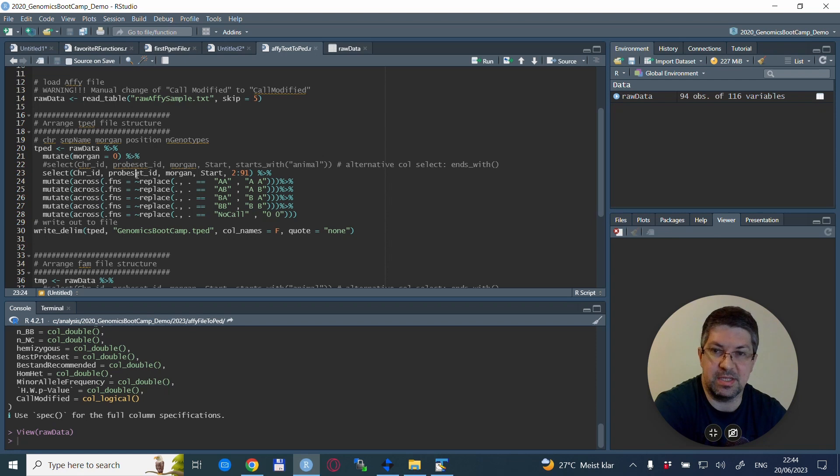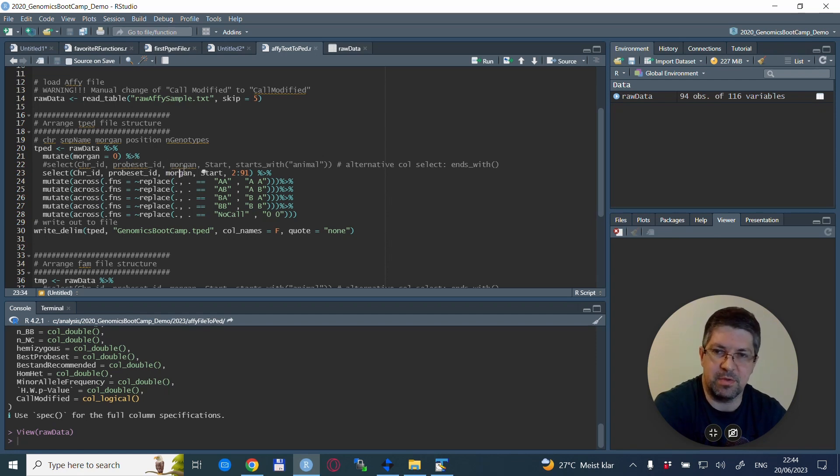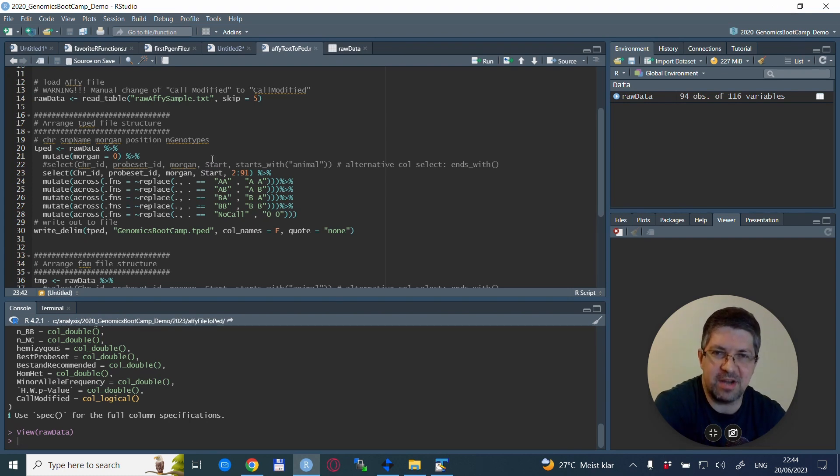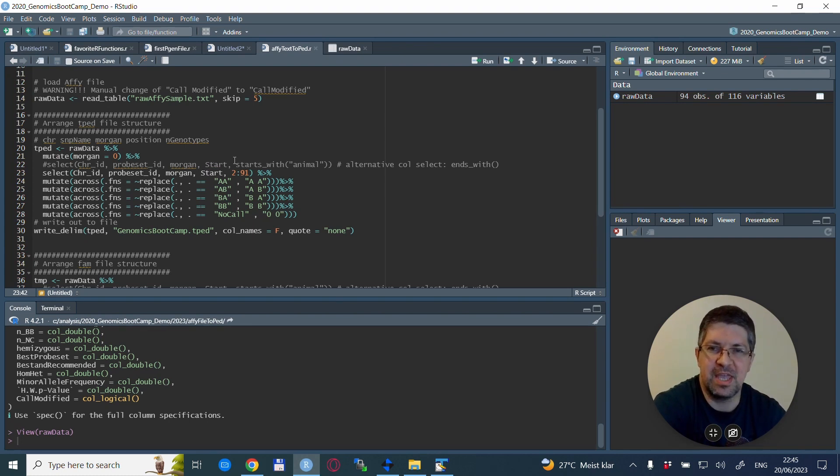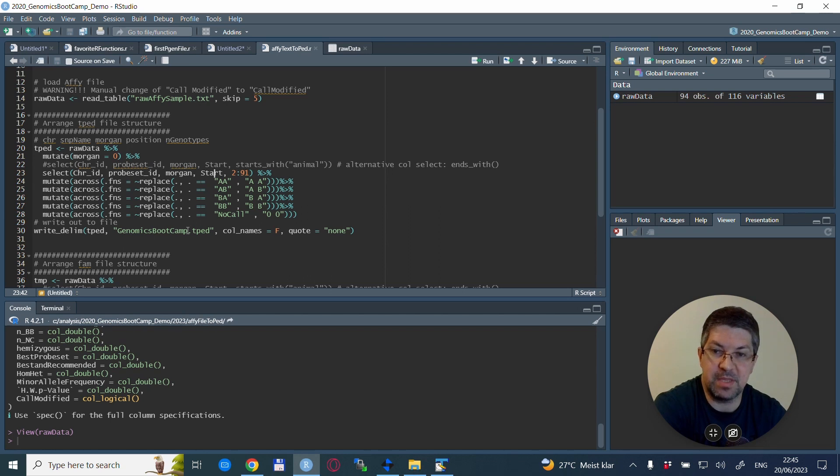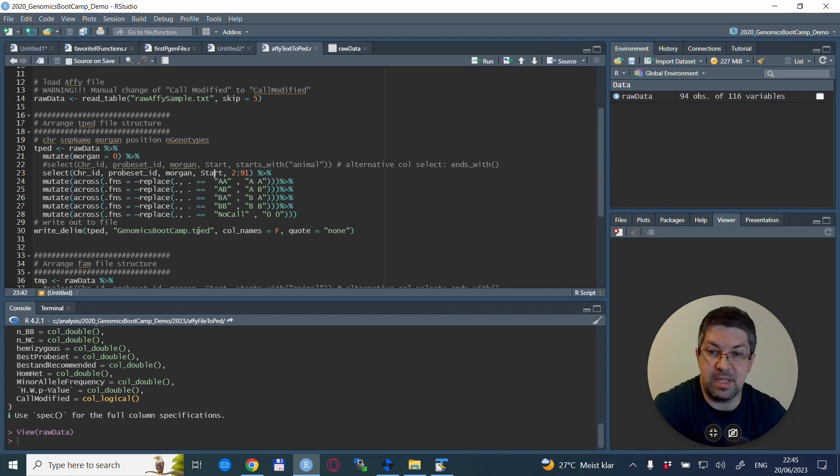Also, the missing genotypes in the Affymetrix file are shown as 'no call,' or basically, this is how it looks like there. So we replace it with zero zero. So this is the standard plink formatting or coding for the missing files. So when this is done, we basically select the columns that we need.